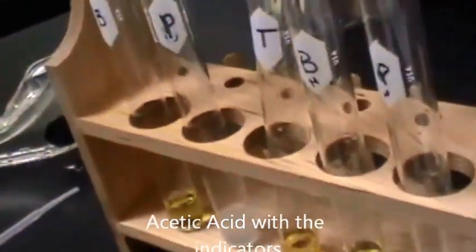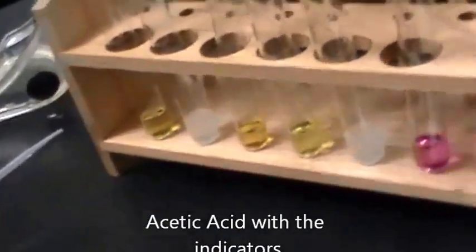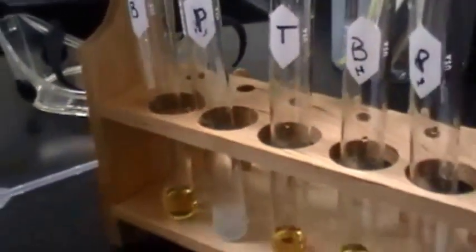Alright, here is our lab for the acidity of beverages. This is our interactivity and we're dropping the base NaOH and acetic acid with bromothymol blue.